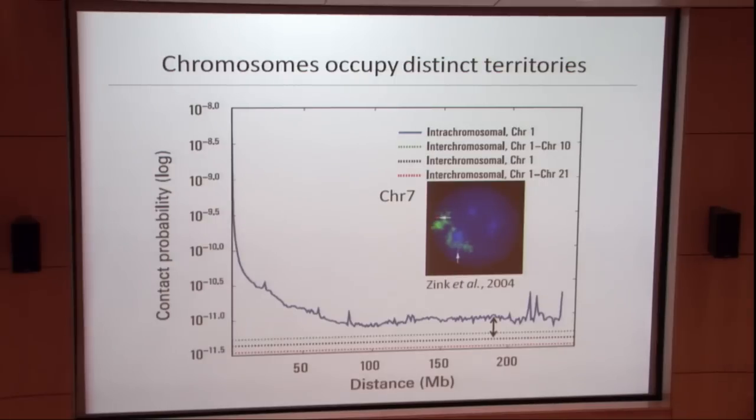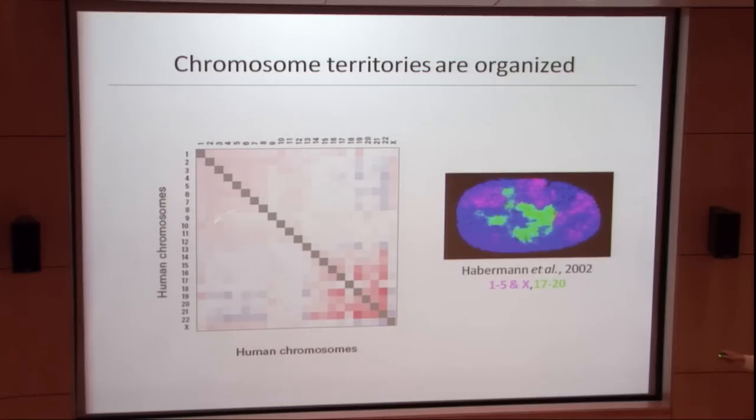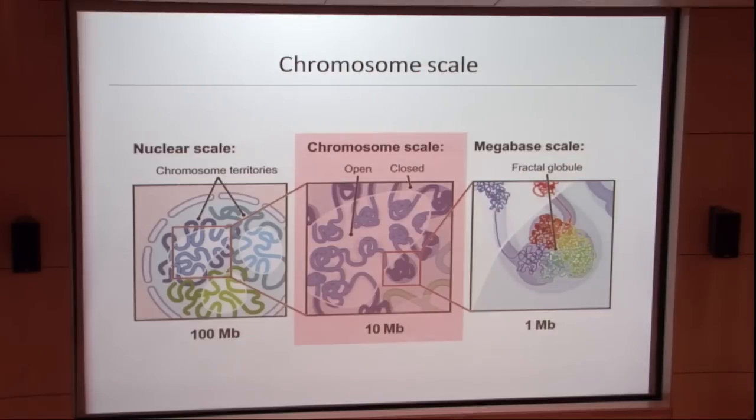They look sort of like Trivial Pursuit wedges, if you play a fuzzy version of Trivial Pursuit. And you can kind of figure out roughly where these things are organized. In principle, you could probably take this map and try to make something that looks more like a microscopy image of this type. Although, I kind of contend that for this type of data, it's just easier to read it off this sort of plot than to actually reconstruct something really fancy. But I think that's just because the data is at an early stage.